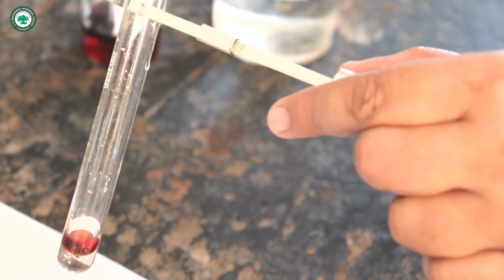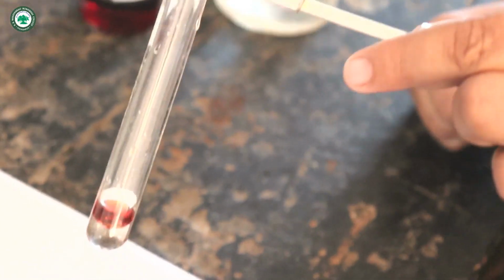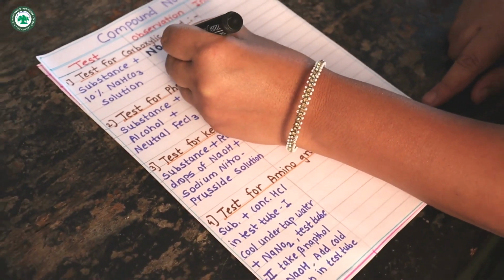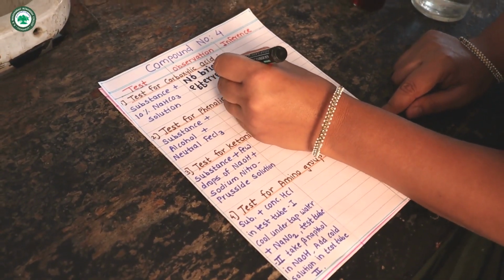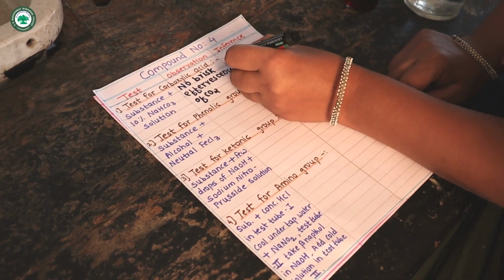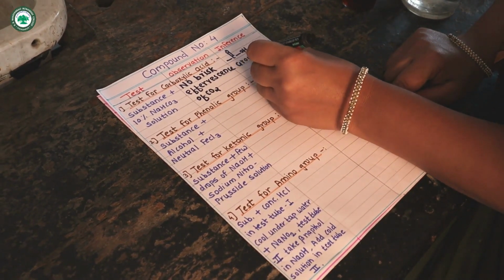It is observed that there is no brisk effervescence of CO2, therefore carboxylic group is absent. Carboxylic group is absent.